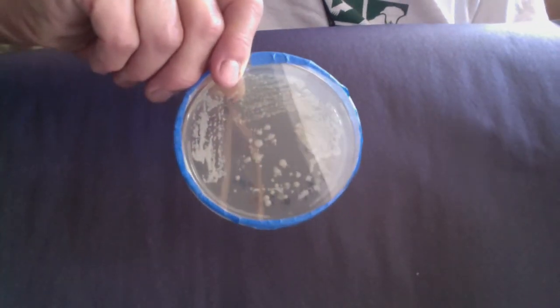I need to get into the lab to do the gram stains to see if we've got molds or yeasts both growing here. Now unfortunately, the TSA plates from day one — this is actually kind of cool biology. I think some fruit flies got in there and laid their eggs in the TSA plates, and the eggs hatched. Now we have all these little maggots running around the TSA day one plates, which to me is really cool. The little fruit fly larvae will eat yeast for sure. So I guess we were lucky that they only got into the TSA plate, not the Sabouraud's dextrose plate. So I don't have very good day one plates to show you.